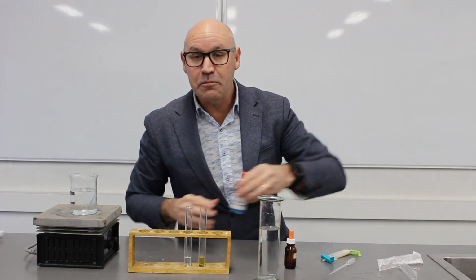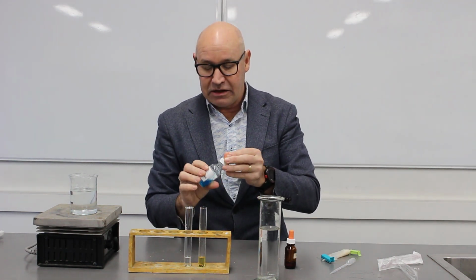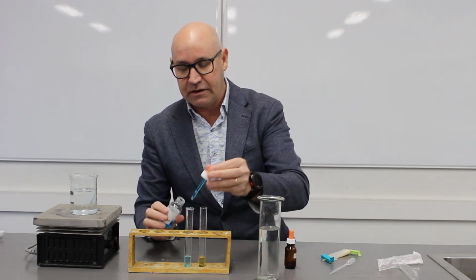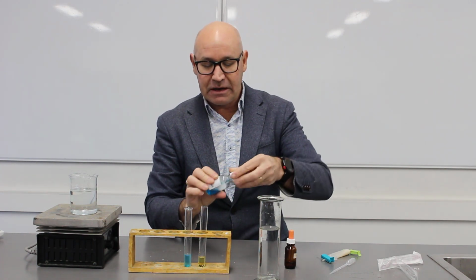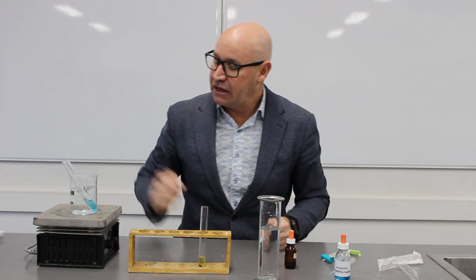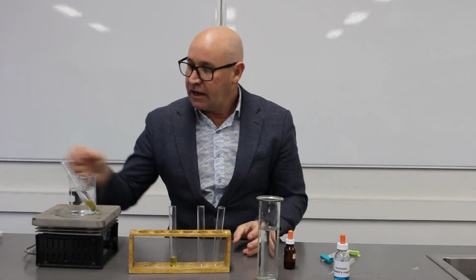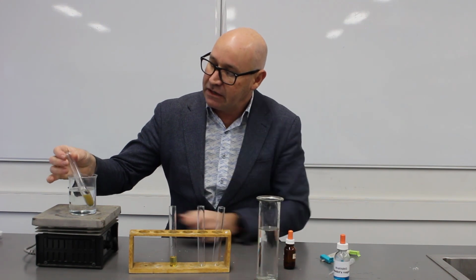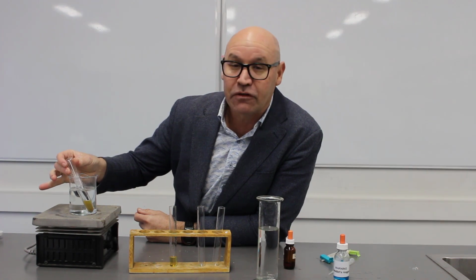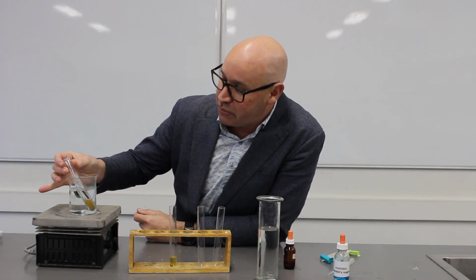Next thing we need to do is do Benedict's test to see if glucose was able to get out of the dialysis tubing and into the water. So we'll put some of our Benedict's solution into the test tube, and we're going to put that in our hot water for around about 5 minutes. Okay, and so as you can see, this is starting to change. This is starting to demonstrate a positive Benedict's test. In other words, we're getting that red brick precipitate.